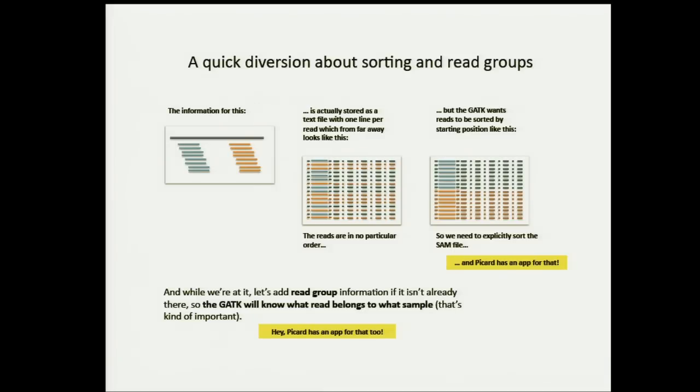Okay, good question. There are other tools that are not really dependent on that. For example, let's say you were just trying to see how often the machine makes mistakes at one site, regardless of whether or not the read came from one molecule or the other. You're looking for machine errors, not DNA errors, right? That's a very specific analysis.